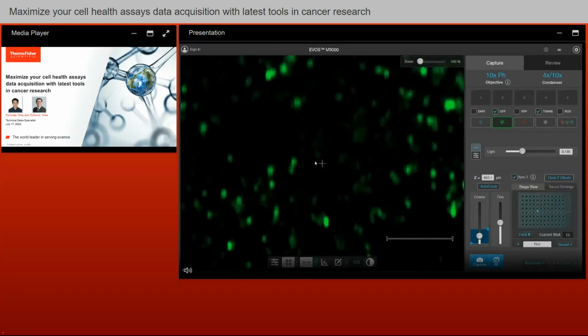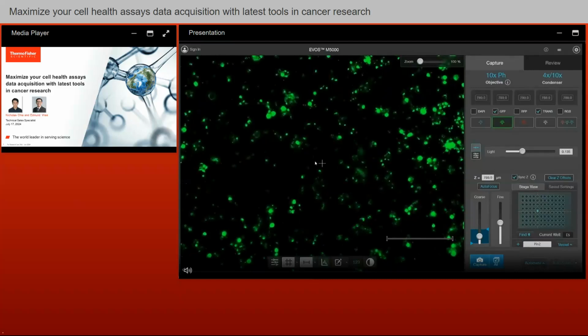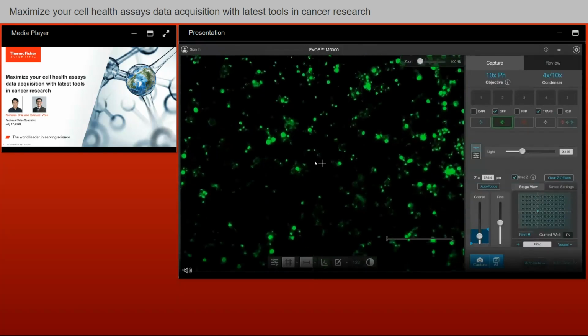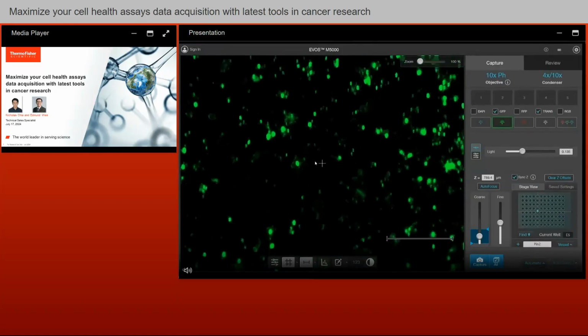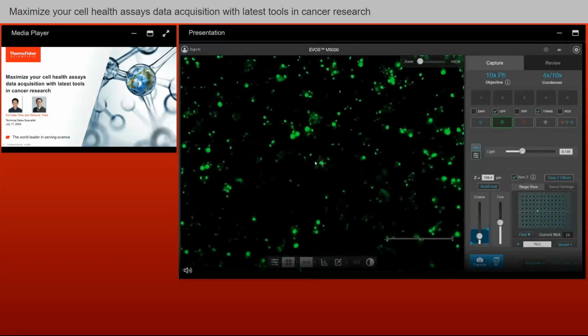I'm looking for a second position, a second location here. How about this? This cell here with another cell that's going through apoptosis on its northeast corner. This will help us to identify this easier later. Now let me add this to the list. So this will be our second pin.